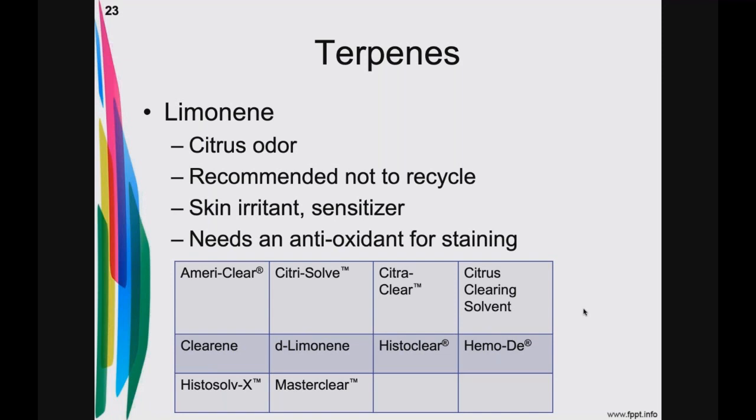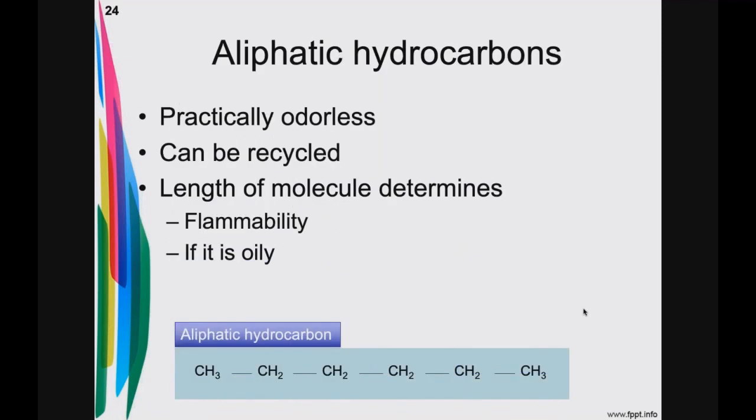So if you like the citrus odor, and you've got good ventilation, because there is such a thing as too much of a good thing. And if you've tried one of these limonene-based products and it was too oily or greasy, I encourage you to go try others, because the formulations from one manufacturer to the other will vary, depending upon if they've added something to cut the greasiness or oiliness of it.